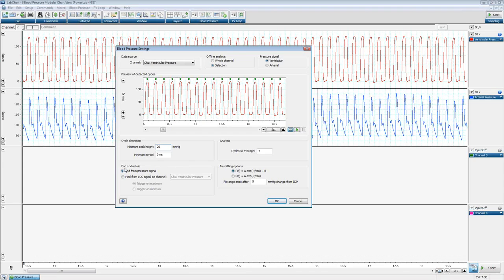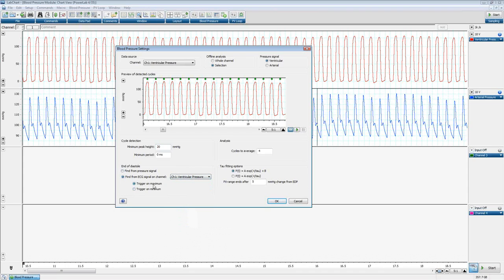For end of diastole, you can find it from the pressure signal using LabChart's built-in algorithm, or use the ECG signal if recorded — you can trigger off the maximum or minimum of the ECG. Since we don't have ECG data in this file, we'll use the pressure signal. Blood pressure also allows averaging over a number of cycles; the default is four but you can set it as high or low as you want. Tau fitting options are available for ventricular pressure — neither option is right or wrong, just pick one and stick with it. You can also tell LabChart where the fit range should end after end-diastolic pressure.